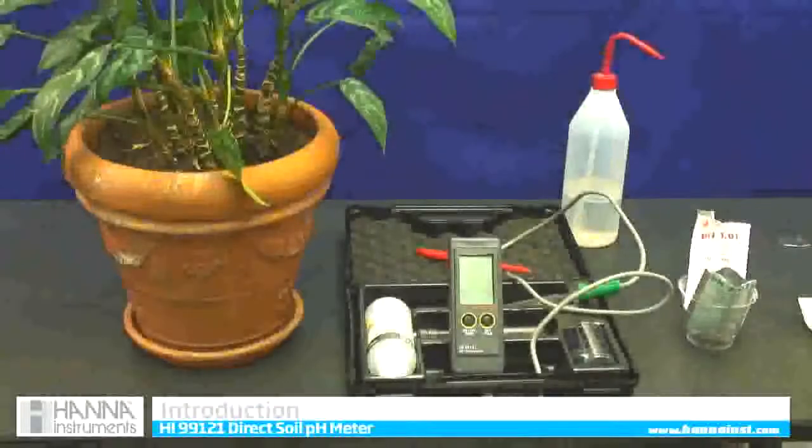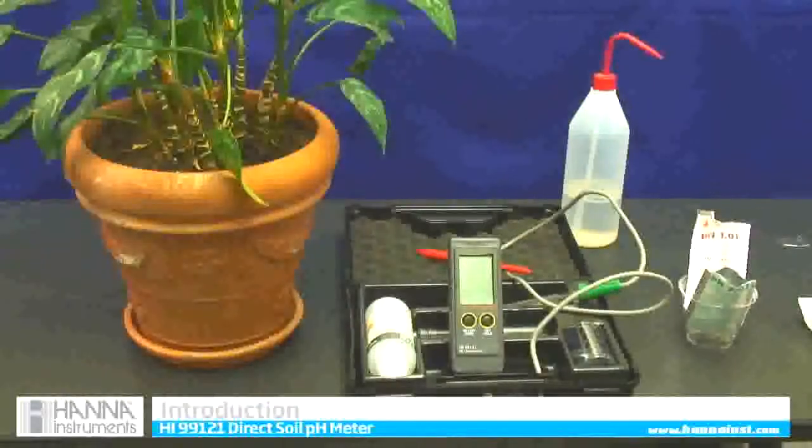This is a Hanna's Instruments HI-99-121 direct stick soil pH meter. It is very accurate — it has been tested by the University of New Hampshire, and the reading you receive on this is the same reading as if you get from your soil lab.